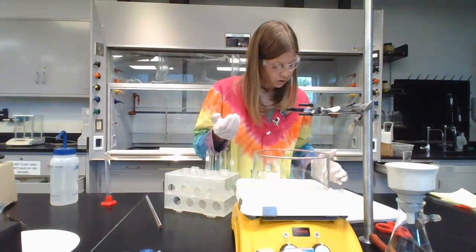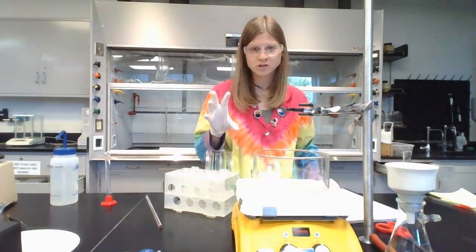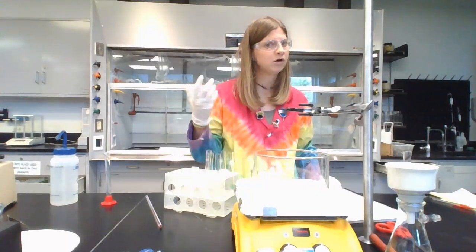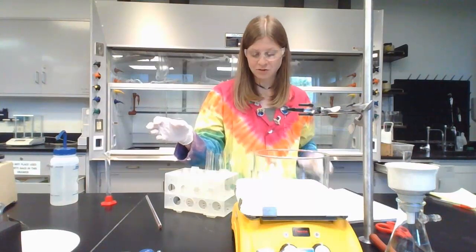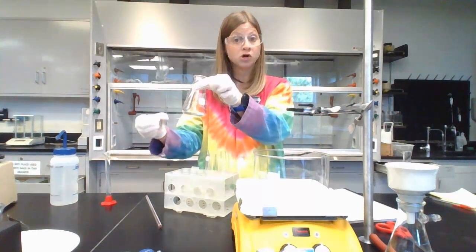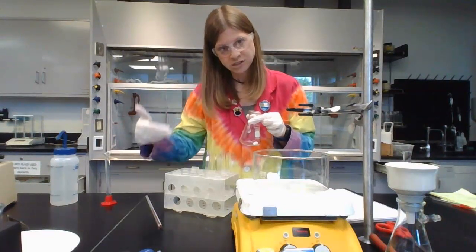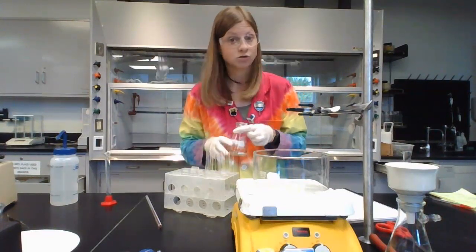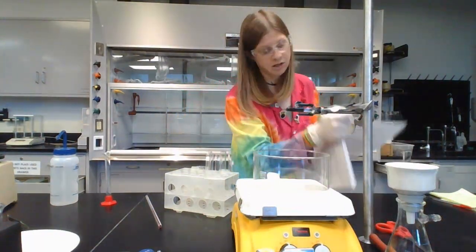Okay. So at this point, you want to take a beaker and put a little bit of deionized water. The lab says 80 milliliters. I would overestimate on that and put like 200 milliliters into a beaker and then set it in the ice bath too. So this buddy's sitting in the ice bath and you're going to have a beaker sitting in the ice bath. Later in the lab, we need ice cold water. We're just starting to make our ice cold water, which is just cooling down the water. Okay. So there's two things sharing the ice bath.